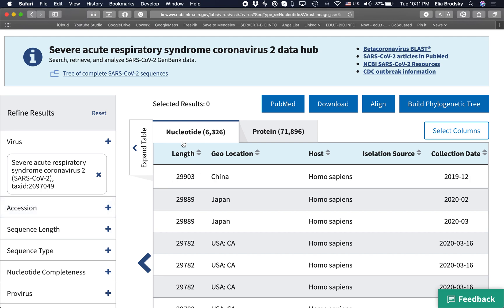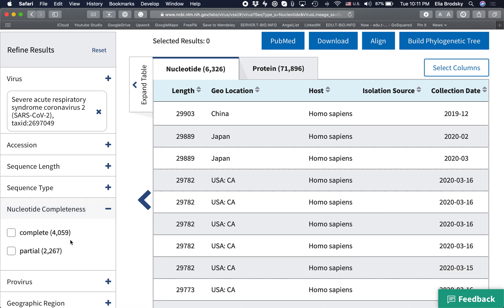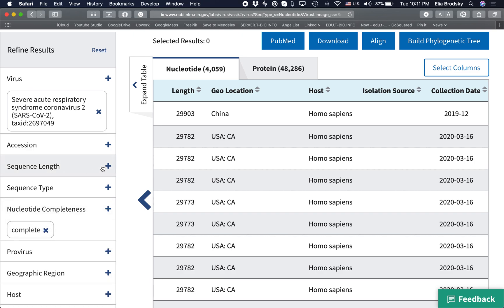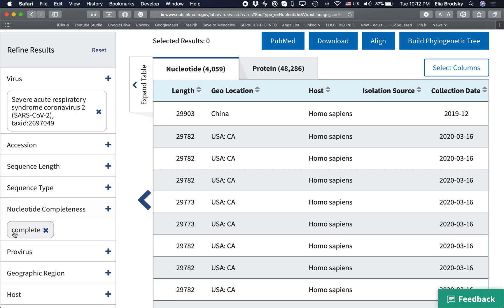If we want to limit this number, we can first select sequence length or nucleotide completeness. We know that the coronavirus is about 28,000–29,000 nucleotides long, so we can either select 'complete' or give it a minimum and maximum length. After we filter for only complete nucleotide sequences, you will see that there are just 4,000 nucleotide sequences available.